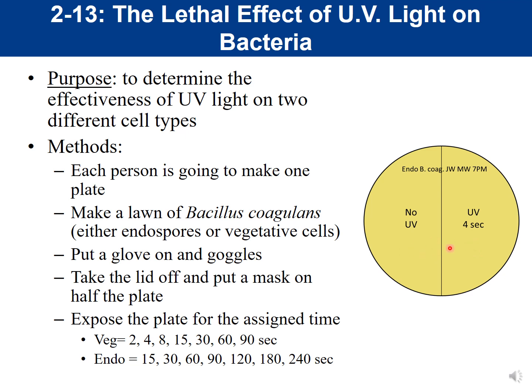You would notice when doing this that it's difficult to reach the bottom of the plate when swabbing side to side. So you would rotate your plate 90 degrees and go side to side again — touching the part of the plate that didn't get touched before. Then rotate one more time and go side to side again, allowing you to cover the entire surface. The idea is you want bacteria all over the plate, evenly distributed into what we call a lawn.